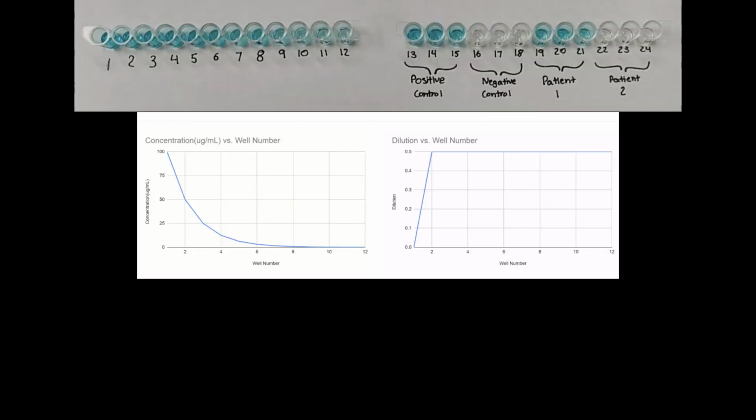In our analysis, the color intensity decreases from well 1 to well 12, which is consistent with decreasing concentrations of the antigen in the serial dilution. This part of the plate can be used to generate a standard curve if the initial concentrations are known, which is fundamental for our quantitative analysis.